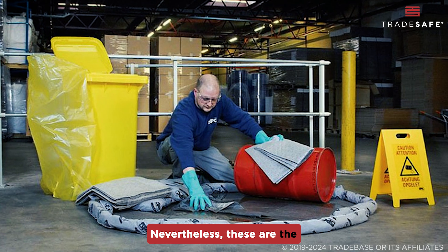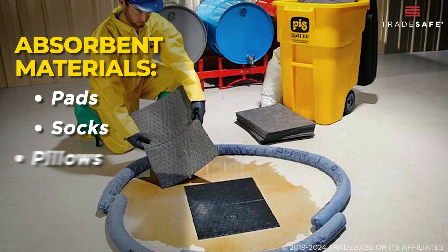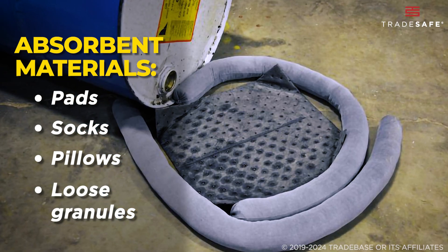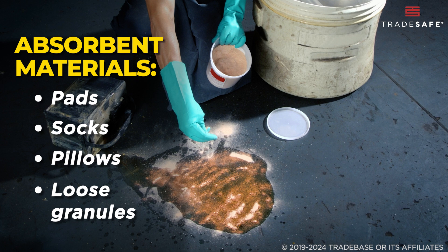Nevertheless, these are the common components you'll find in a typical spill kit. Absorbent materials such as pads for direct placement on spills, socks to contain and prevent further spreading, pillows for absorbing larger volumes, and loose granules for uneven surfaces.